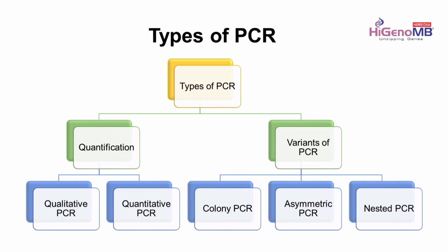Based on the applications of PCR, there are a plethora of variants, but I am giving here 3 important variants. One is called colony PCR. If people know cloning, how do you know whether the plasmid that you have cloned has got the insert? You would like to know if the plasmid DNA has been taken up by the bacteria, and if it has, whether the plasmid DNA carries the insert that I had put into the plasmid. To verify it quickly, people do colony PCR.